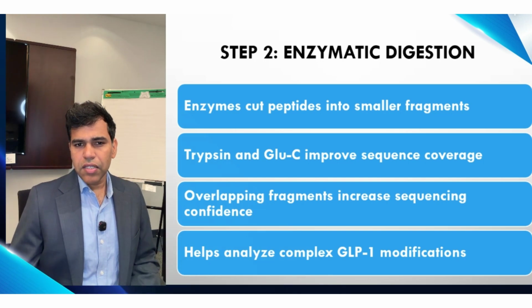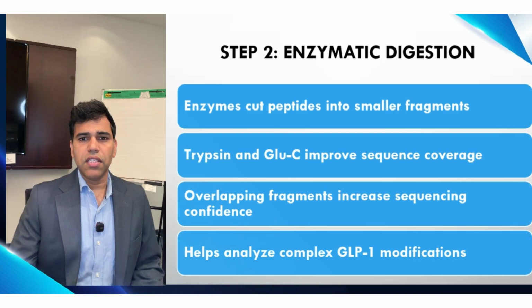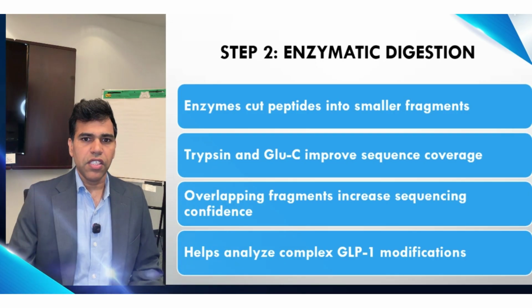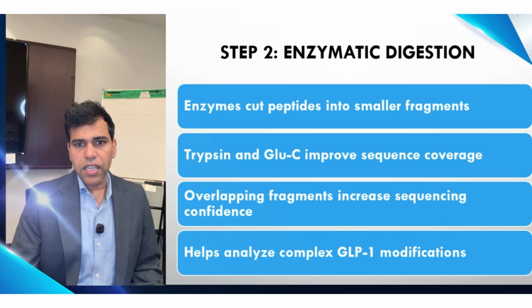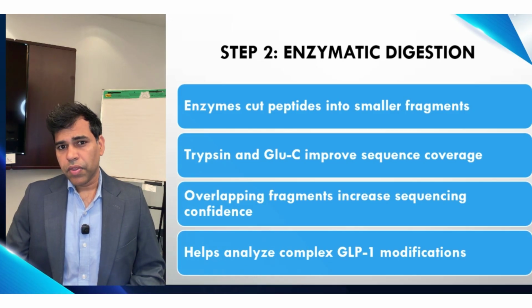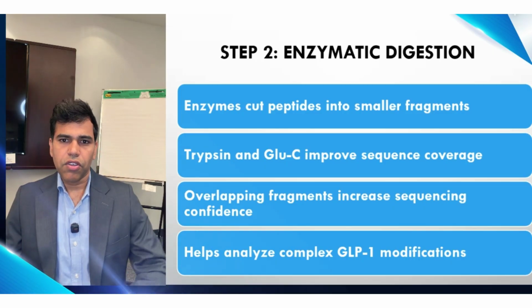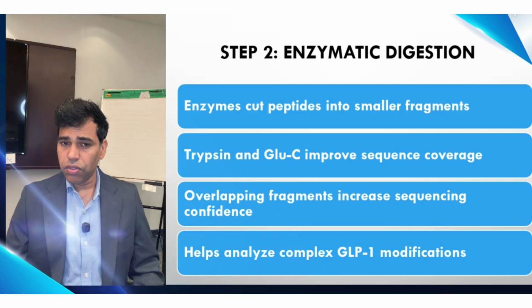The fatty acid modification at lysine 26 creates a site that some proteases won't efficiently cleave, making that region analytically invisible. If you're not specifically designing around that, your coverage map has a blind spot you may not even know exists.